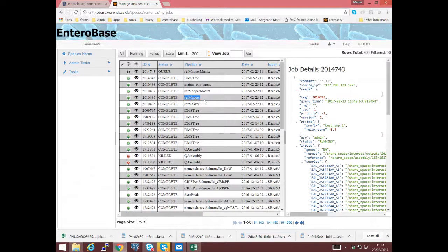Then all those positions are fed into another program, which will work out the consensus. For instance, if at a particular position that area is missing in greater than 10% of the genomes, it won't be called. And also any masked regions will be excluded in the ref mapper matrix job.